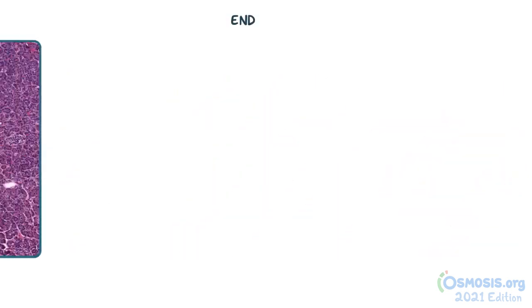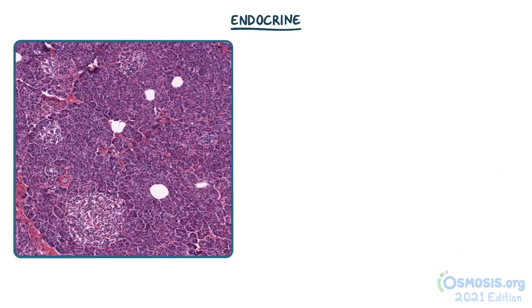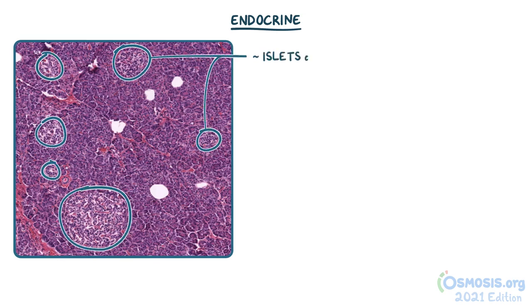Let's move on to the endocrine portion of the pancreas, which forms clusters of paler cells such as the one seen in this image, called islets of Langerhans. The overall size of the islets can vary, but they can be identified pretty easily by their lighter stain and smaller cells when compared to the surrounding exocrine tissue.